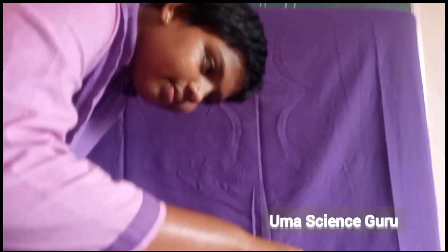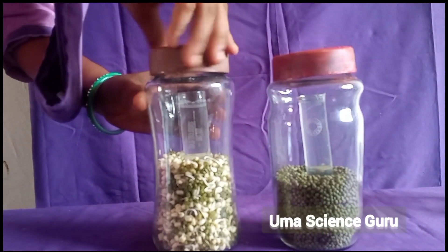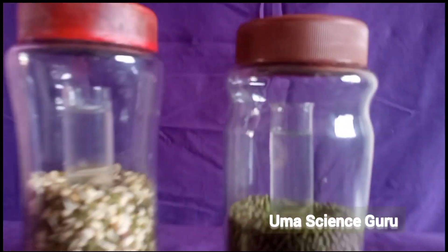Close the bottles tightly. Students, observe the bottles — in both sets, lime water is very clear. Keep these seeds undisturbed for two days.